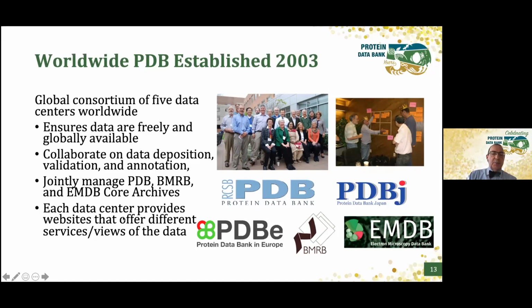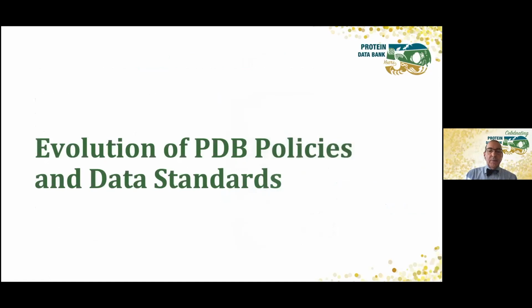Each data center provides its own website, and these websites offer different services and different views of the data. And you'll get a sense of that over the next 2 sessions as you see screenshots coming from the RCSB Protein Data Bank and Protein Data Bank in Europe, our collaborators in this event with the Royal Society of Chemistry.